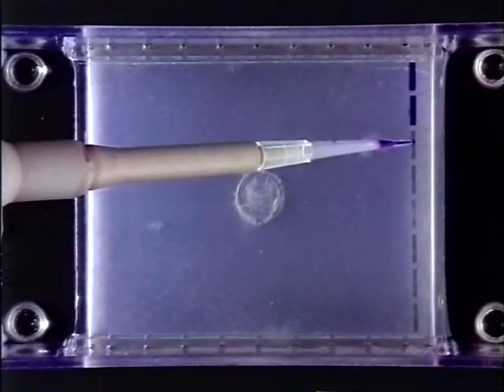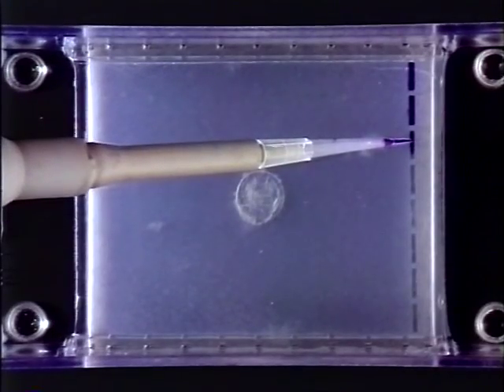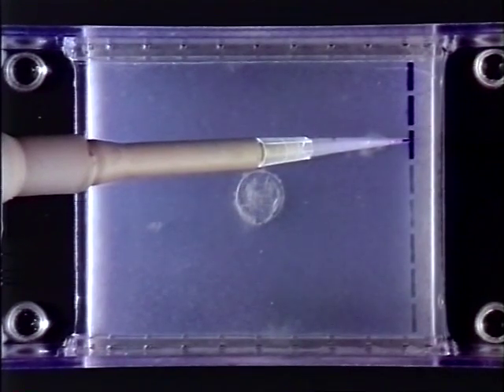The same procedure can be used to analyze biological molecules such as DNA. These experiments begin by running fragments of DNA precisely cut by restriction enzymes. These fragments are of known length and are called marker DNA.